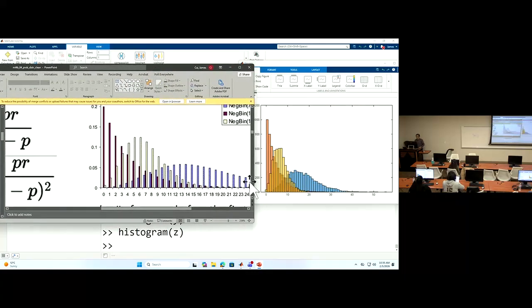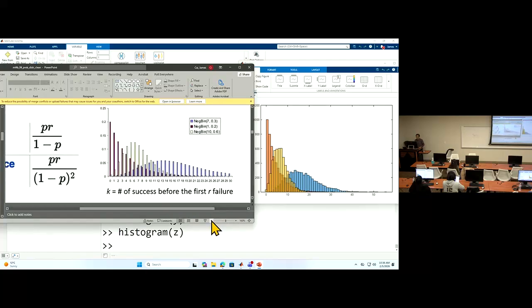So if you compare this with the one in our slide, they're the same histogram. Okay, histogram, to show you the distribution you want to observe from your variable, your data. Then different parameters generate different types of gene expression.